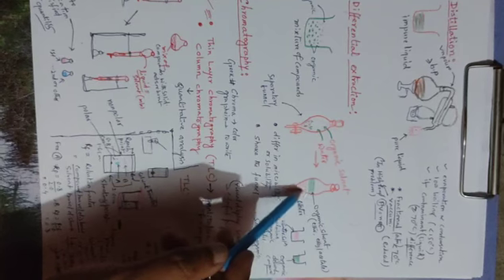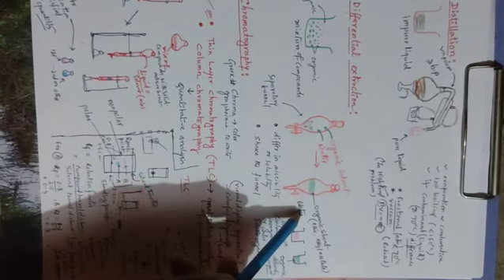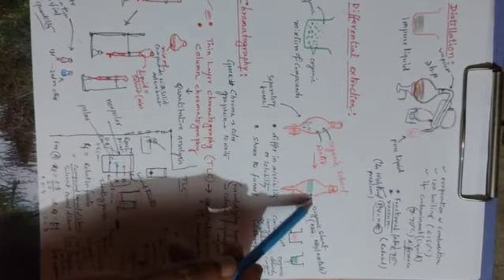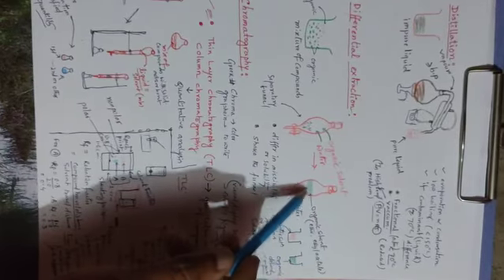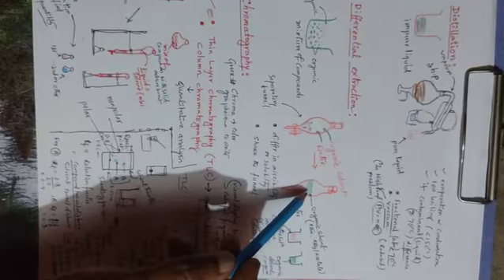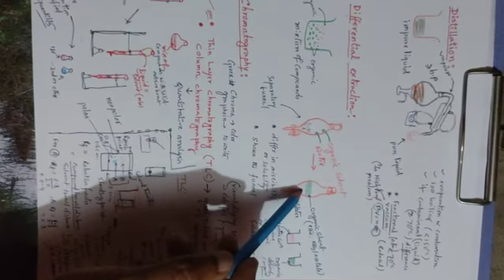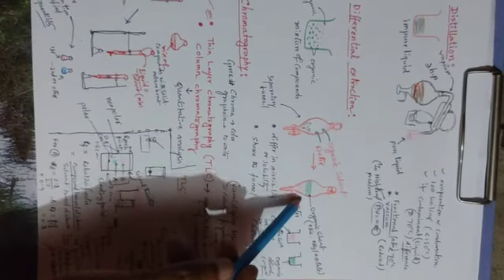In general, the organic solvent layer will be on the upside and the water part will be on the downside, unless we use a chlorinated solvent like chloroform or dichloromethane. In that case water will be on top, and the chlorinated solvent with our product will be on the downside.